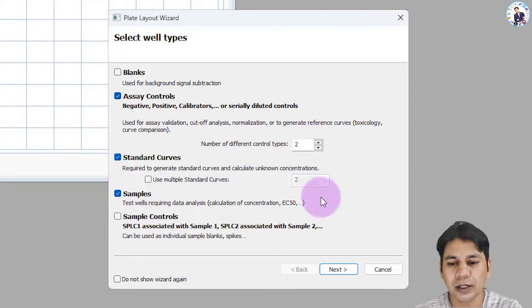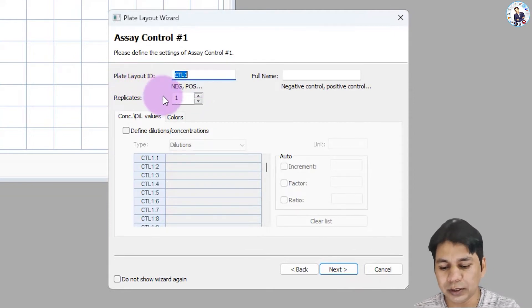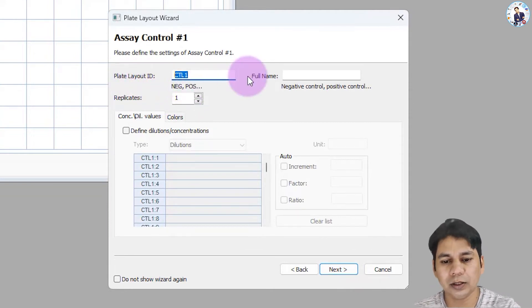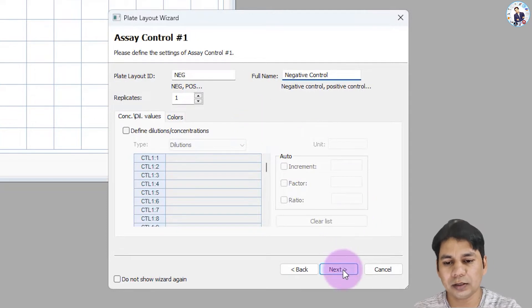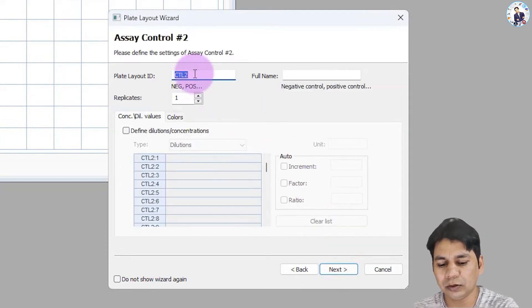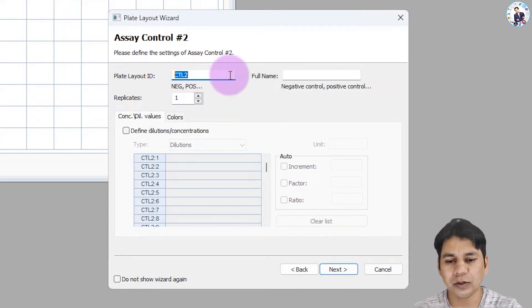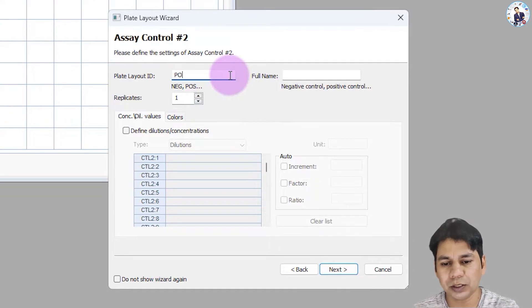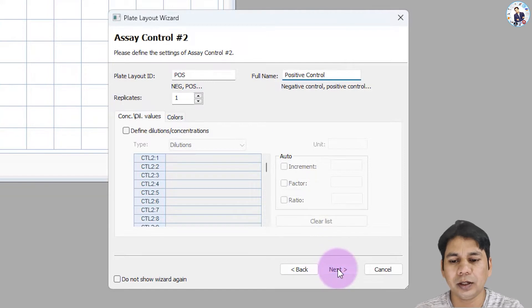Define the plate layout ID for the controls. My first control is negative; here you can put the full name. Define the next ID for the control — this is for the positive control. I am selecting the full name. Click on Next, then go to the standard setup.